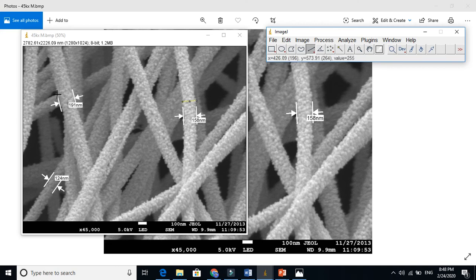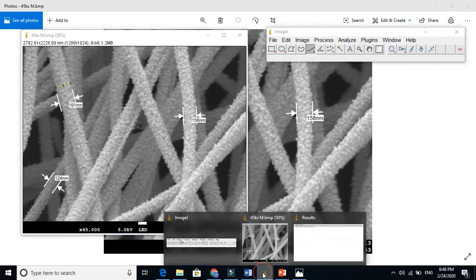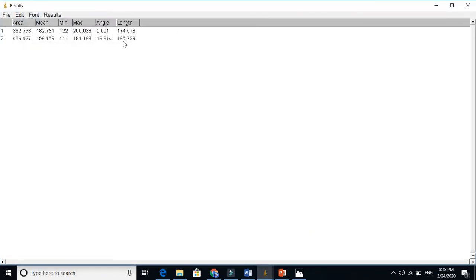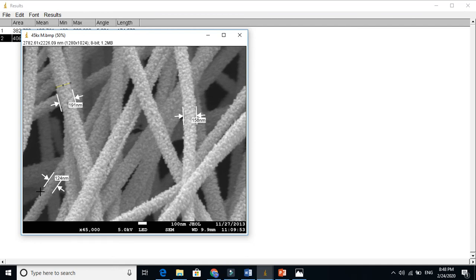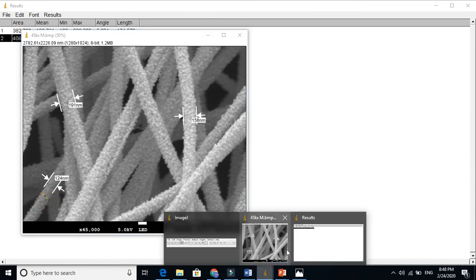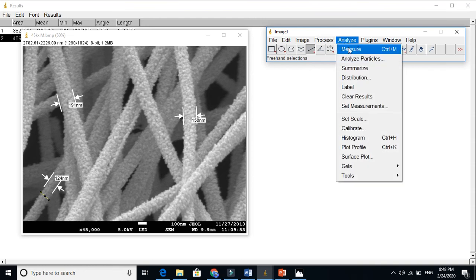Let's try this one now. This one here — this is 124. We need a very meticulous job. Go to Analyze and Measure.